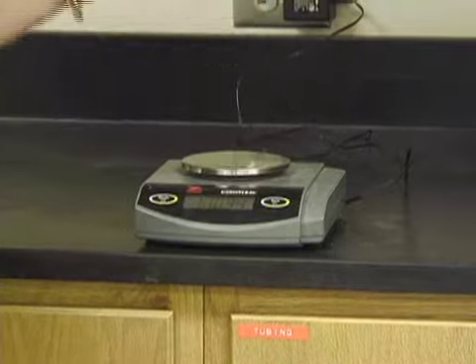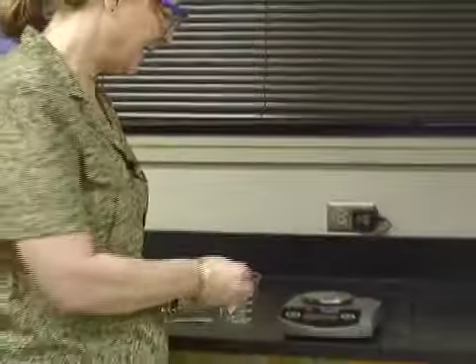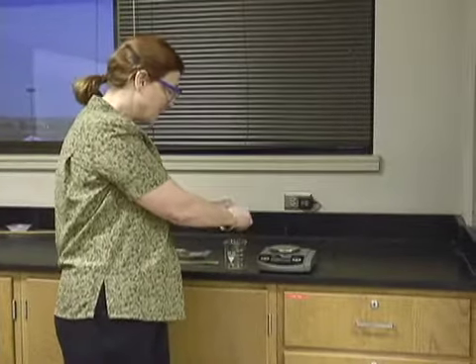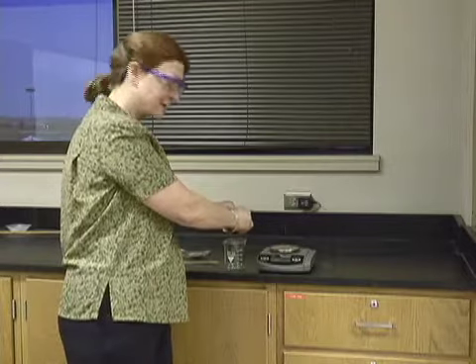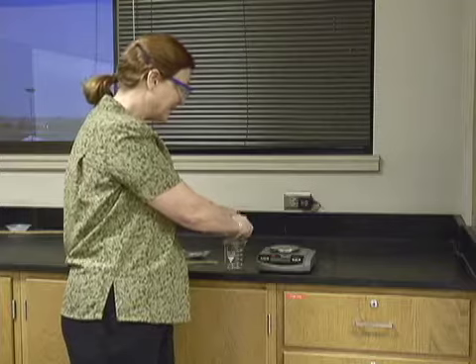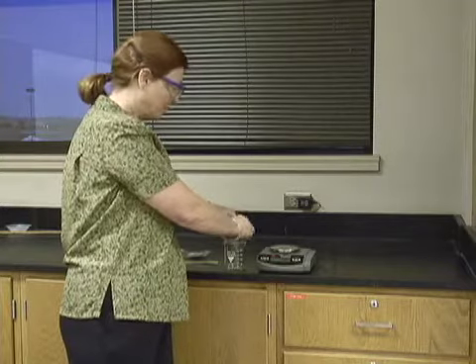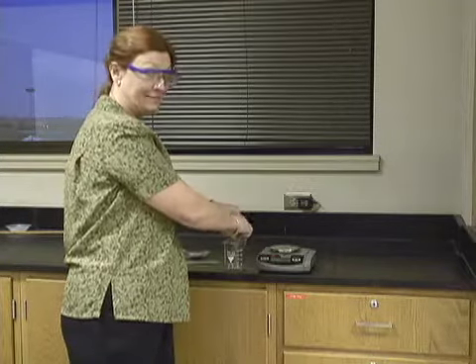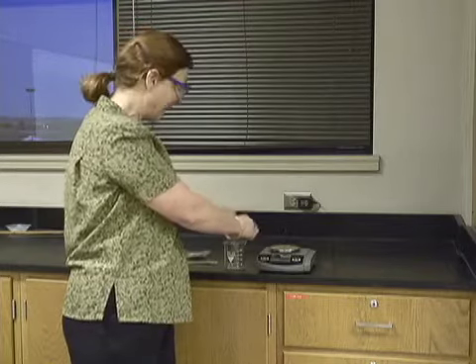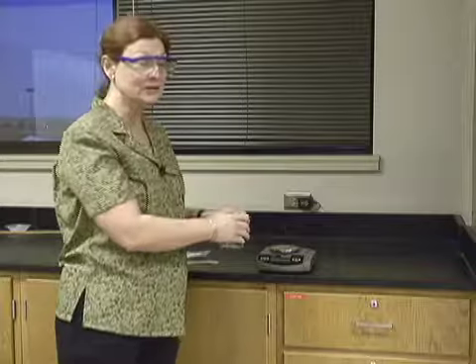Now, I'm going to take this beaker and I'm going to add the magnesium. I'm going to tear it into smaller pieces so that it has greater surface area, and the hydrochloric acid that we're going to add will react more quickly. And you know I'm the impatient one. Even though I've been doing these labs for many years, I still am anxious.